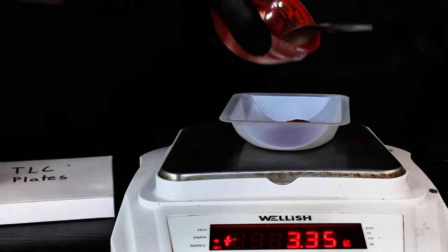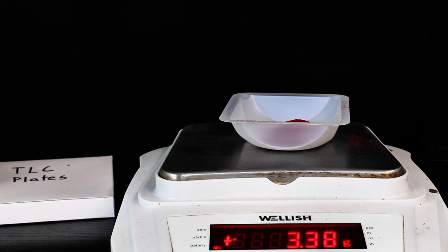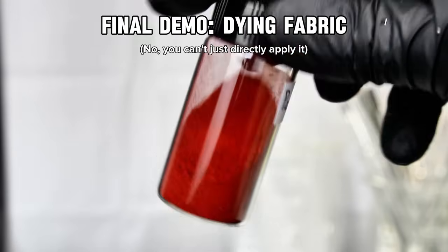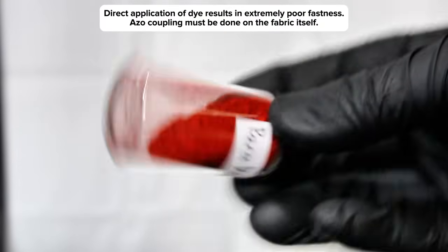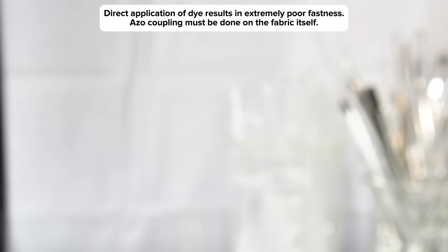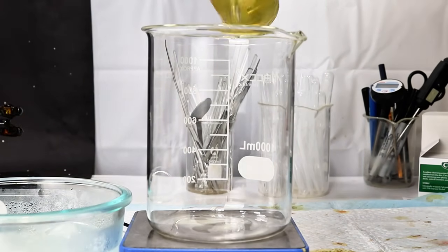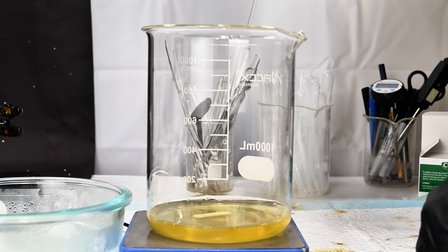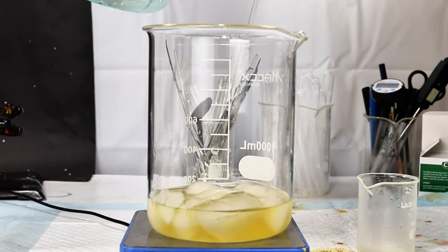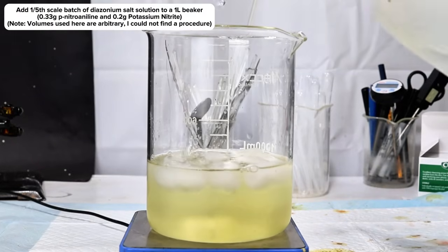As a final demo, I thought it would be fun to show how you can actually dye some fabric with this stuff, considering its main use is a fabric dye. You might think that dyeing fabric is as simple as dissolving the para-red in some kind of solvent and dipping whatever fabric you'd like to dye into the mixture. While this procedure does somewhat work, the problem is that when it's applied this way para-red has very poor fastness, and as a result it'll end up washing out pretty quickly. What you have to do instead, in order to correctly apply this dye and ensure a high level of permanence, is to conduct the azo coupling reaction directly within the fibers of the textile itself.